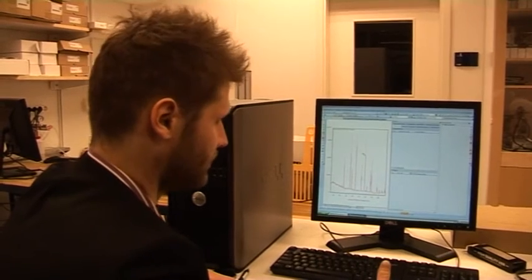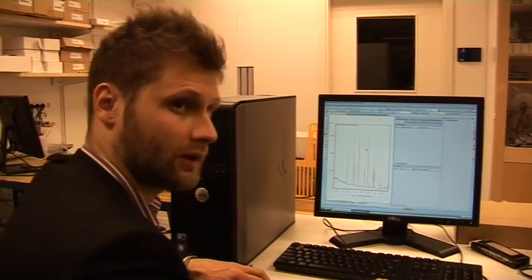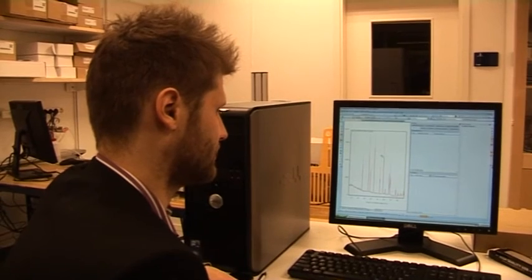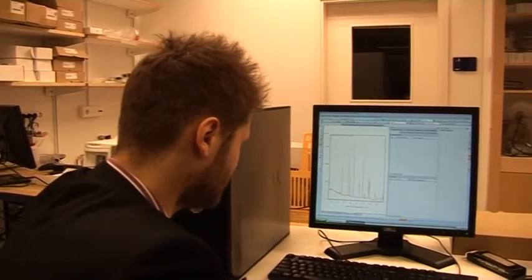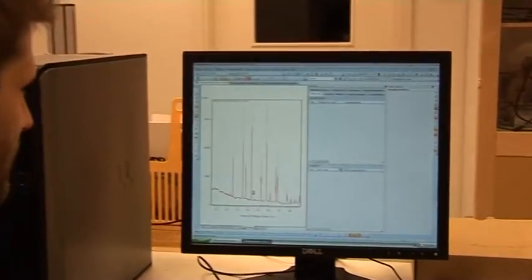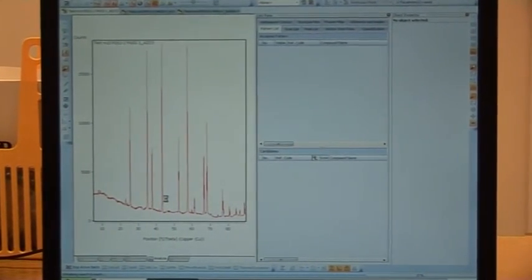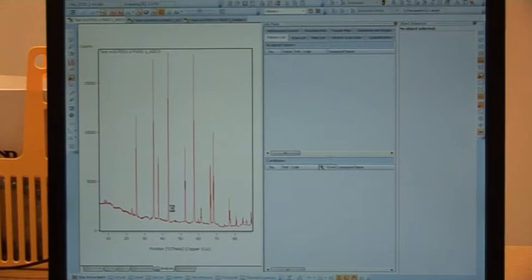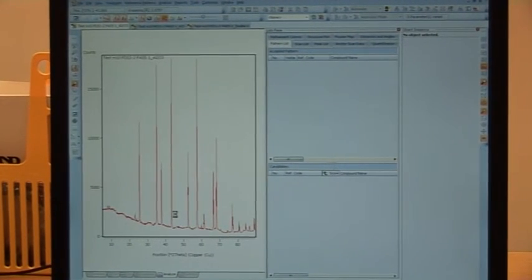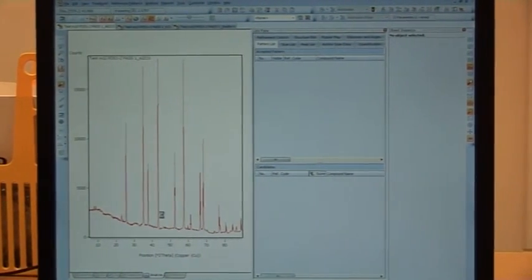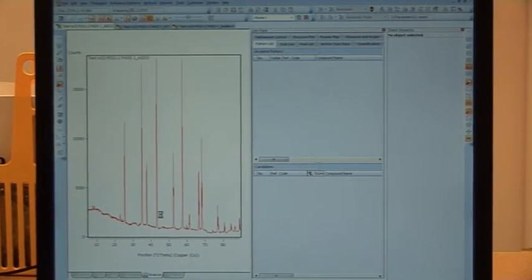You can do it manually, you can do all things manually, or you can also ask the software to do it for you. And that's what I'm going to do now because otherwise it might take a very long time to do a very nice manual fitting. If I now ask the machine to just do all this treatment, background stripping and so on, and also by pressing that button I ask the machine to do a search and match. It will try to identify what it is by comparing to the reference diffractograms that we have in the database.